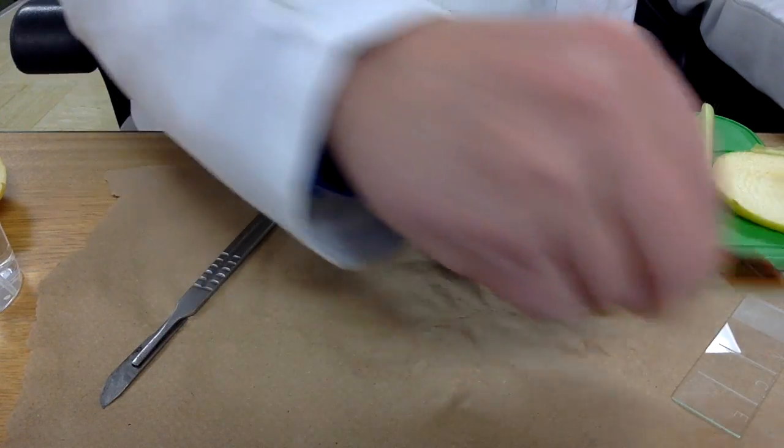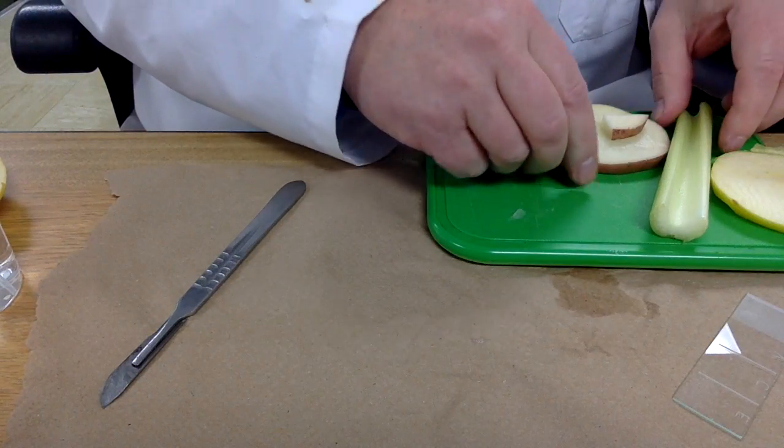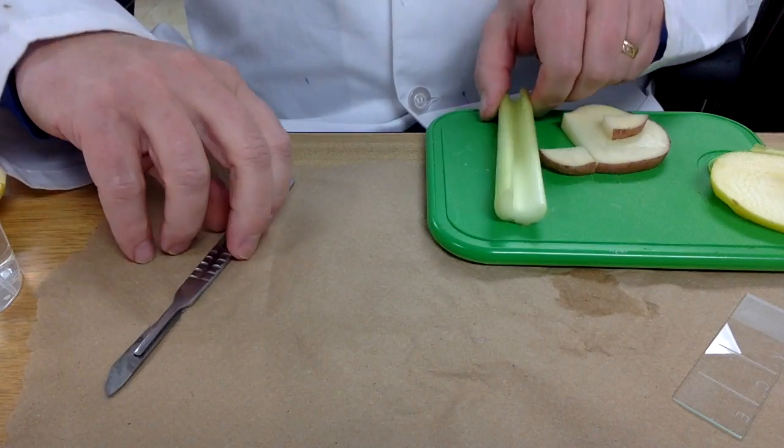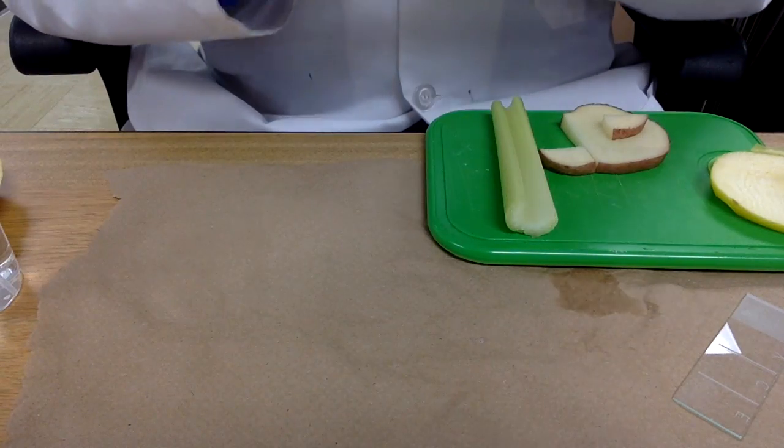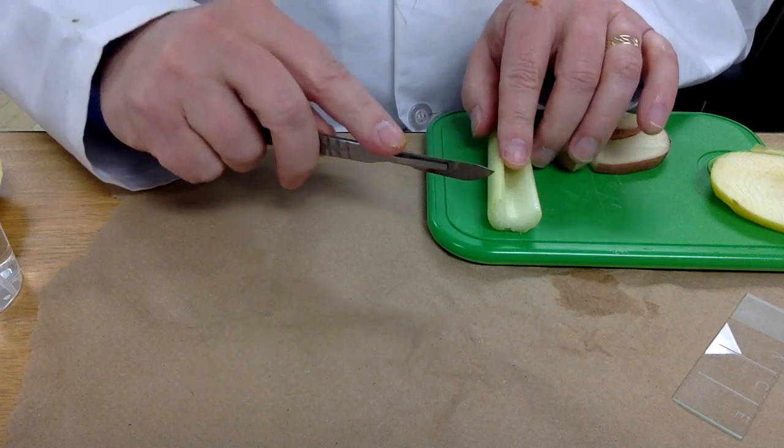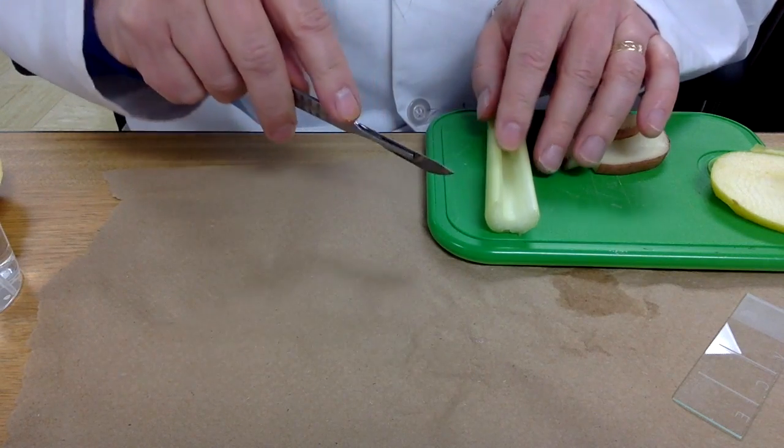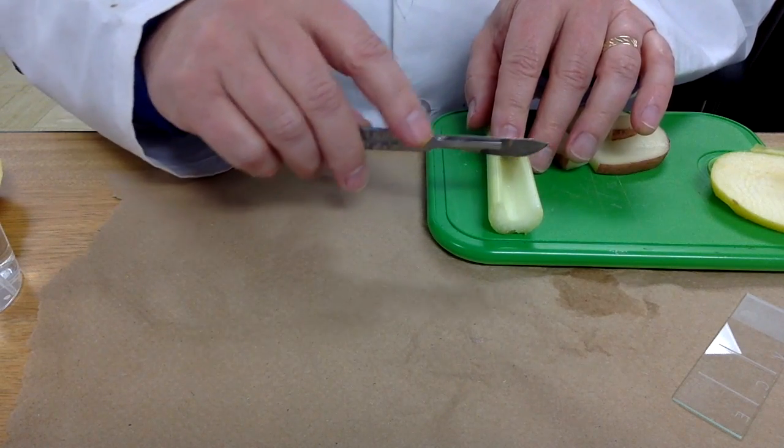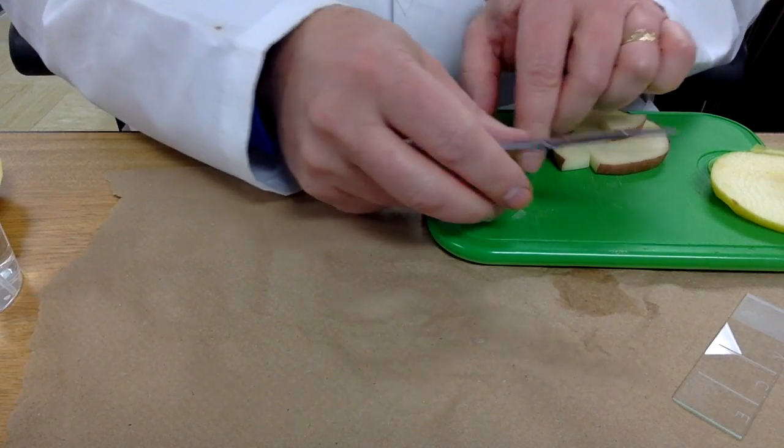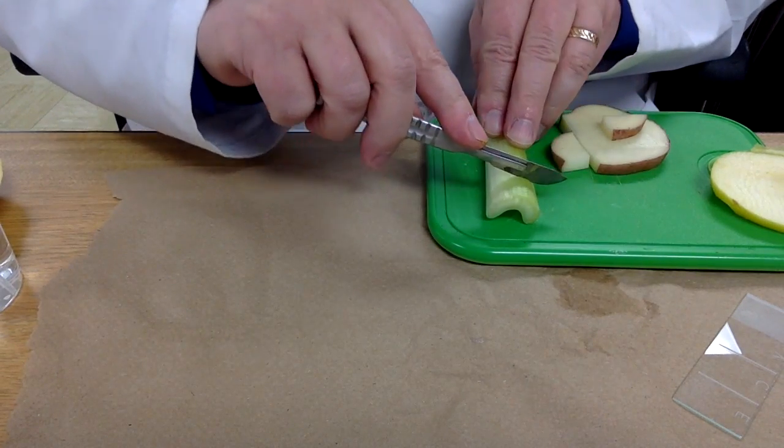What I'll be showing you with the celery are two basic cuts. The first cut I will make is called a cross cut. I'm going to slice right across the celery stem.